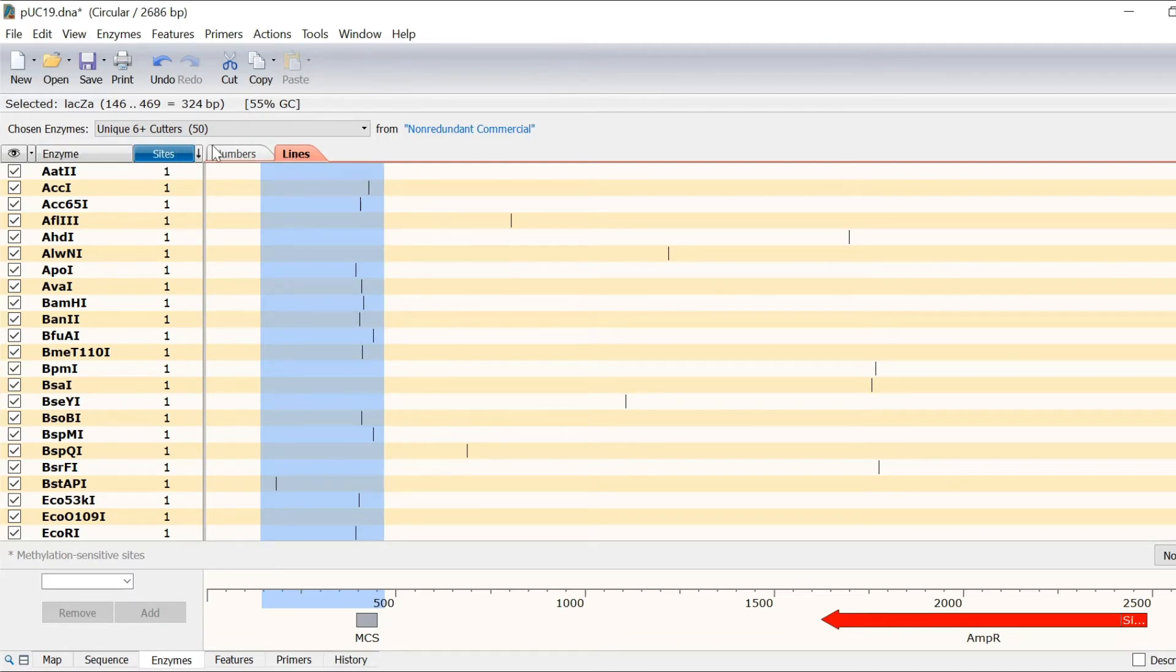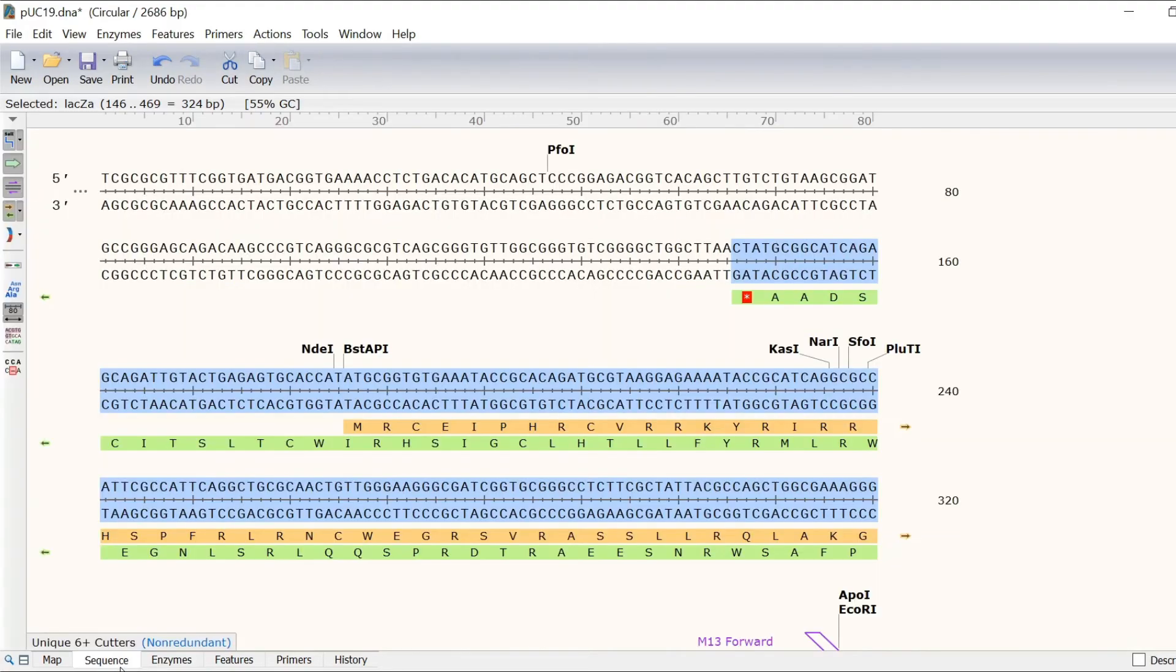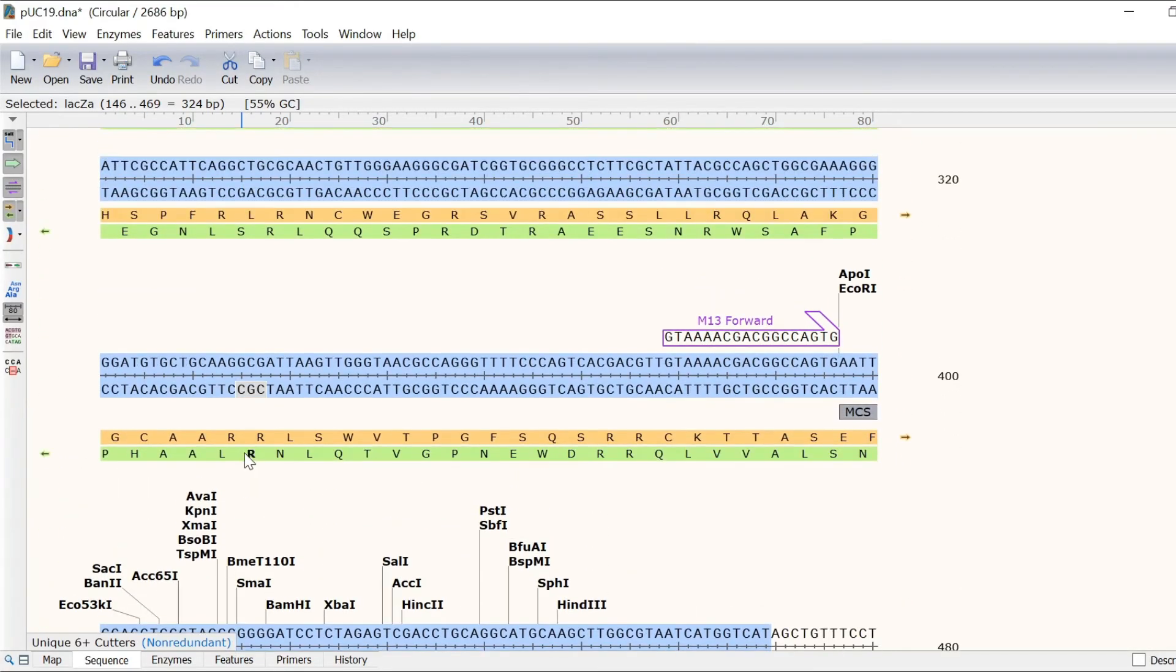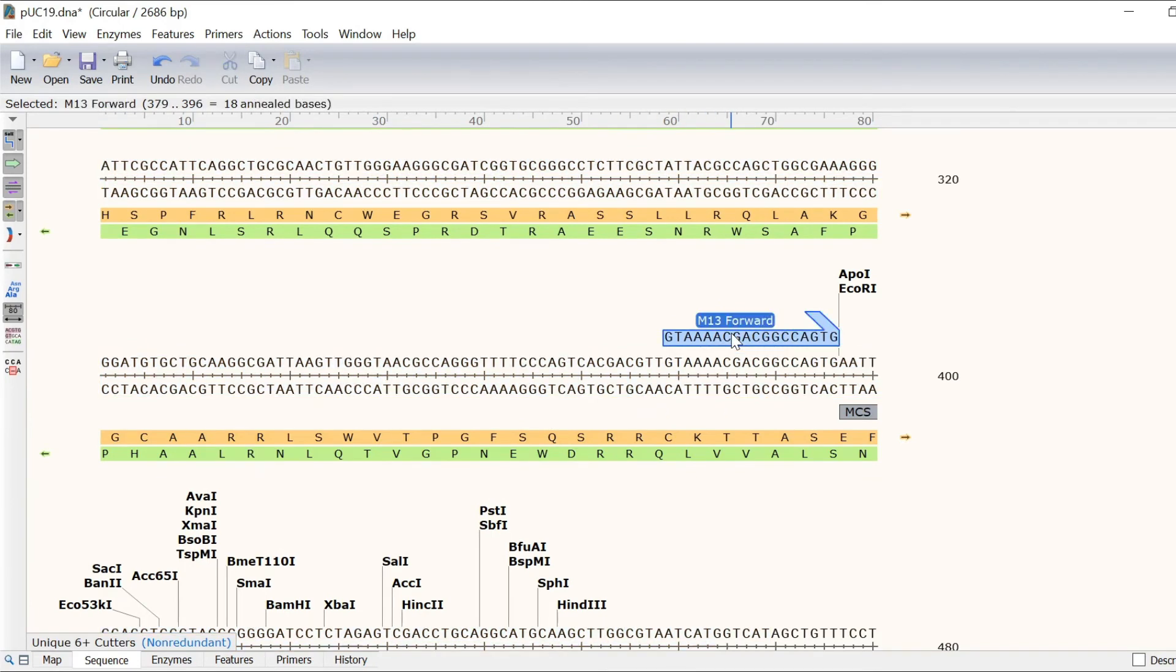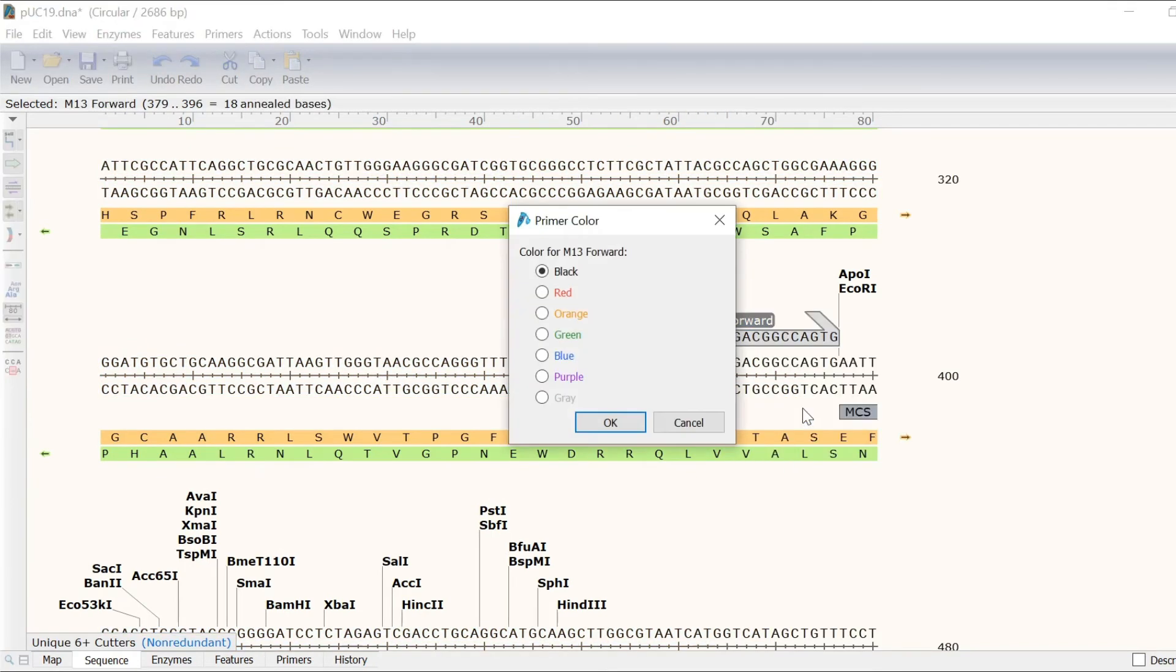As well as enzymes and features, Snapgene also defines primers that can be created and highlighted. Primer binding regions can easily be seen in the sequence view. You can even change the primer colour by right clicking and selecting primer colour.